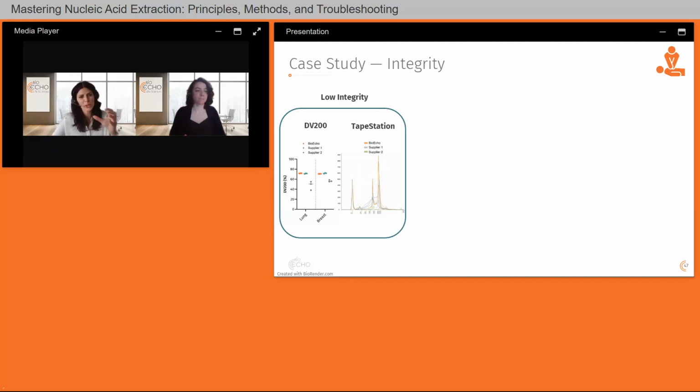And what I can also say with FFPE, it's important to think about the input, because usually the worst part of the FFPE samples is the paraffin. We want the tissue. We don't want the surrounding paraffin. So if you have the chance, reduce the paraffin as much as you can, trim it, because by that you put a lot of tissue in the sample and thereby prevent paraffin carryover. This usually helps. And then it's just isolating tissue with some specialties.